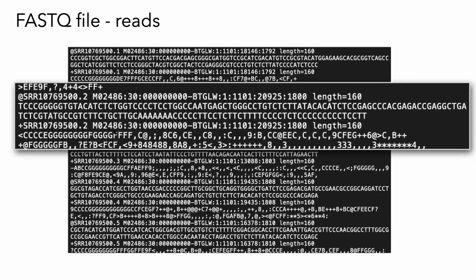Now, based on this quality, we can determine whether we can use the full sequence or we should trim it based on poor quality. And we can also understand whether our overall quality is good. So there are a number of different outputs that we will look at shortly that allow us to deal with different levels of quality.